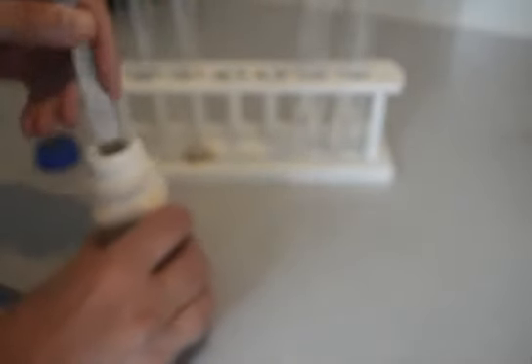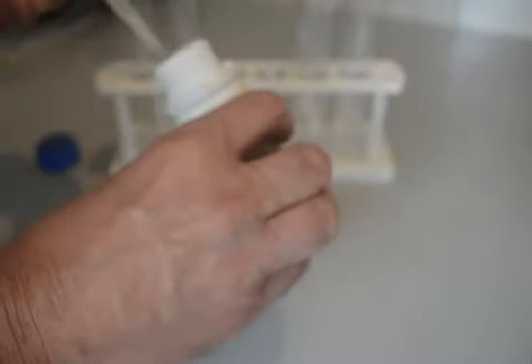What we're going to be doing is a precipitating reaction where we're going to put the two compounds into a solution and they're going to dissolve and form a clear liquid.